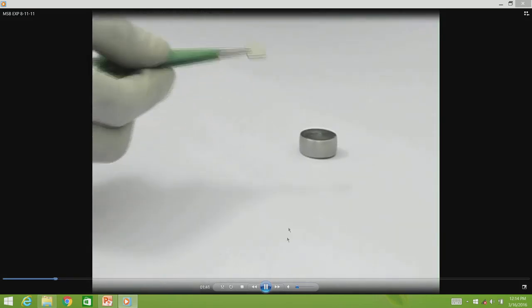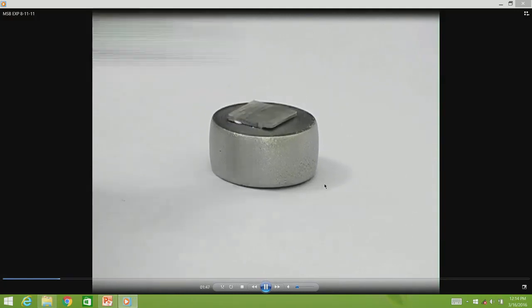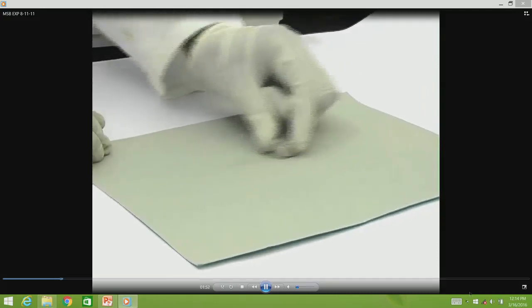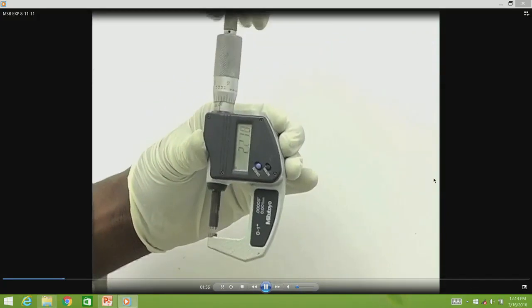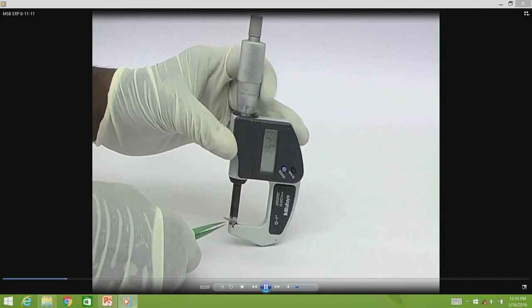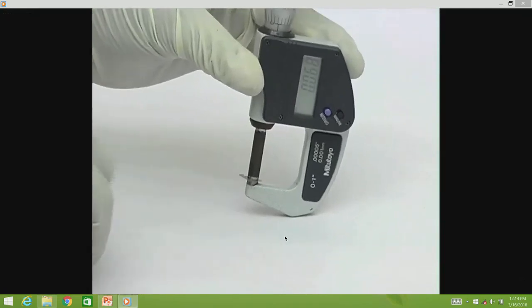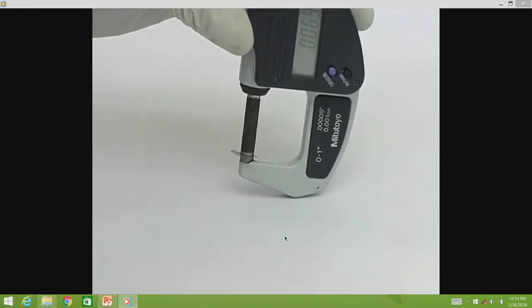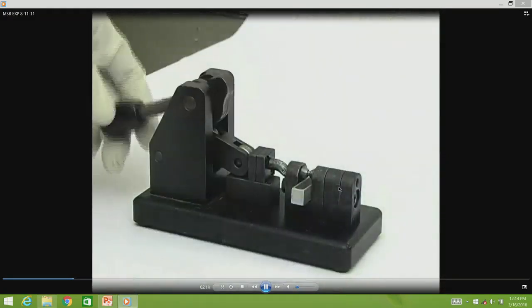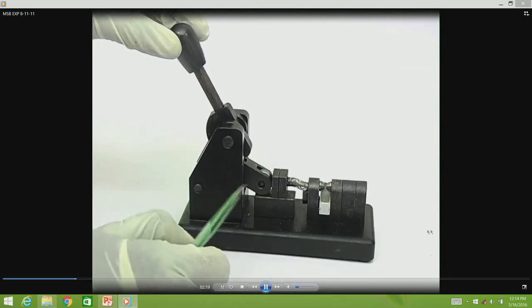The thin section is further polished by mechanical thinning — it is pasted on a bulk sample and rubbed on a very fine emery paper, and you measure the foil thickness with a micrometer. The thumb rule is it should be below 100 microns. Here we have about 67 microns thick foil, and then that foil is taken into the punching machine.